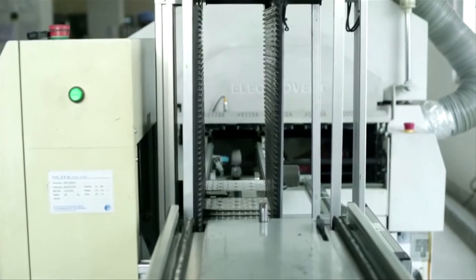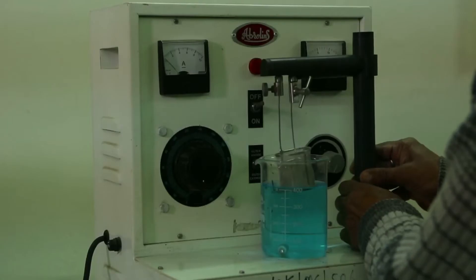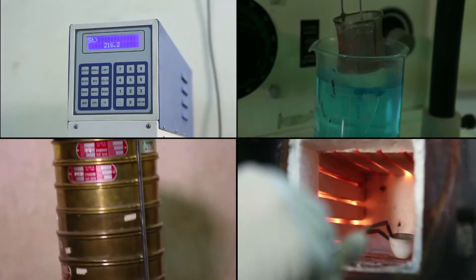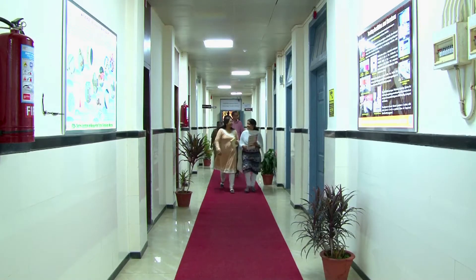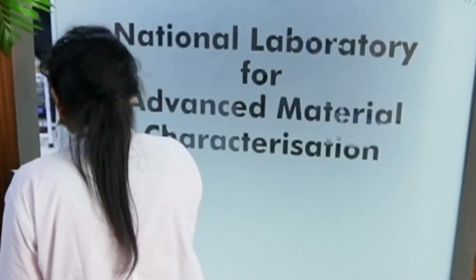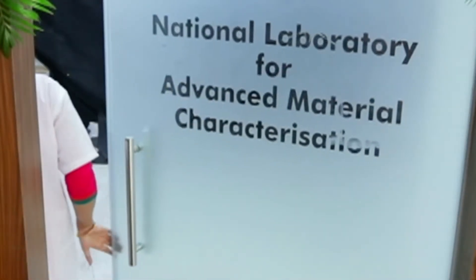This is where the need arises for laboratories that support advanced scientific research in the field of material testing. Laboratories like this one, National Laboratory for Advanced Material Characterization.